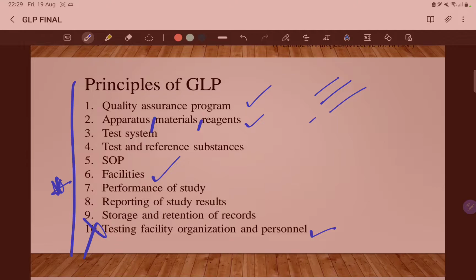For test systems, there will be physical and chemical test systems and biological test systems, so records of source, date of arrival, and arrival conditions of the test systems should be noted. Cleaning and sanitization of the containers and pest control agents are to be documented, along with records of source and proper identification of test systems in their containers when they were removed.